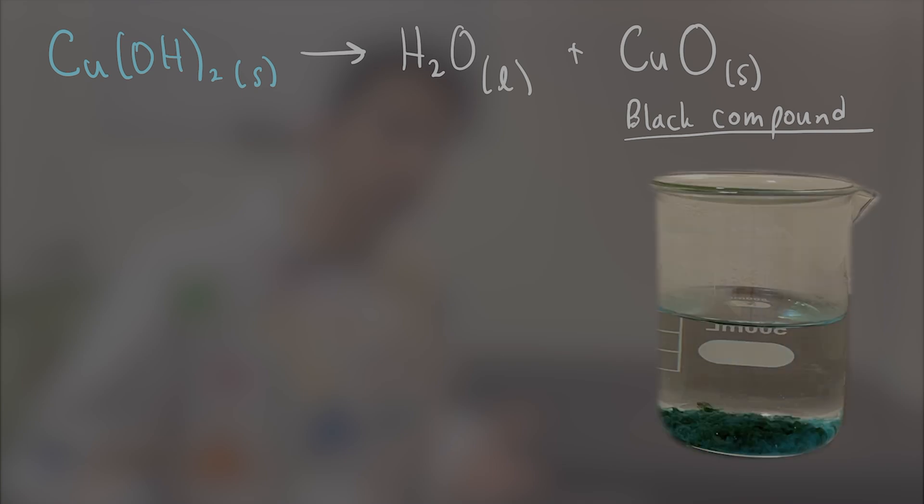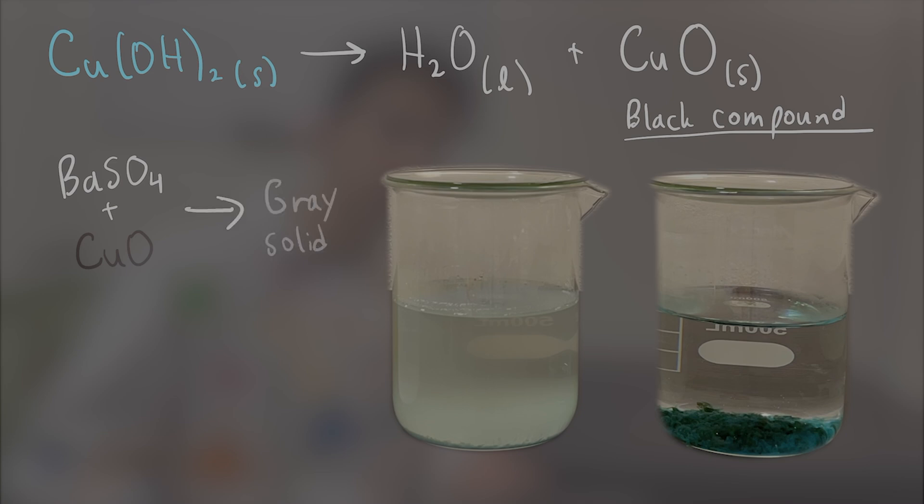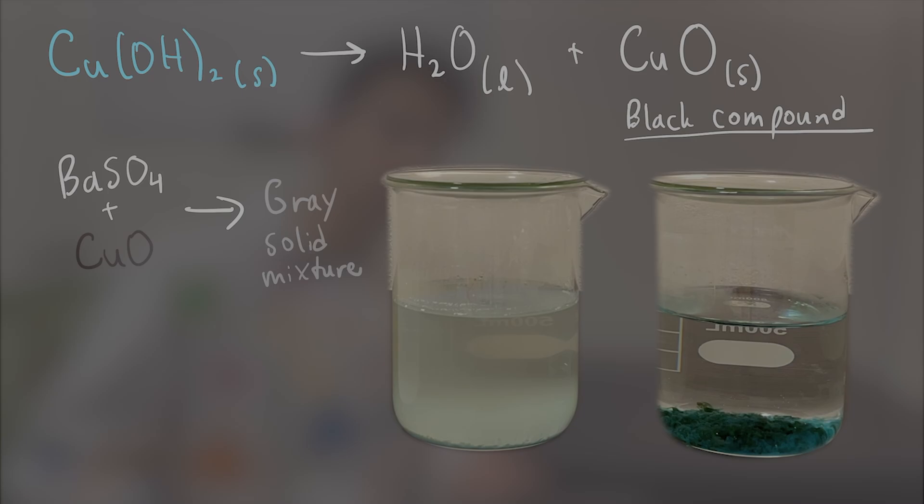Copper hydroxide spontaneously decomposes into water and copper oxide, which is a black compound. That's why the precipitate on the right turned black, and the precipitate in the middle turned sort of a weird bluish gray. The white barium sulfate was mixed with the black copper oxide, which gave it a gray color. With enough time, the two beakers ended up looking like this.